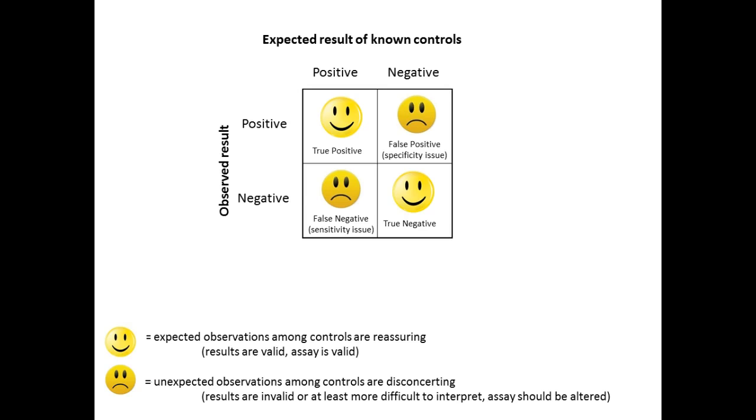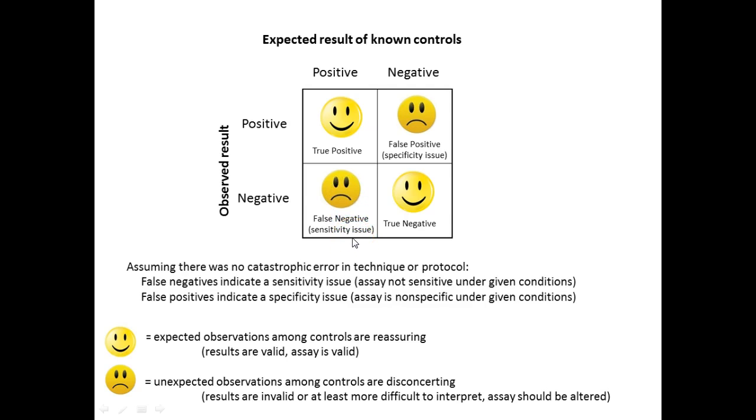So if your observed result is negative, and you thought it was supposed to be positive for your control, this is not good news, right? And this is probably, again, as we said, a sensitivity issue. If you're getting a negative result, it's probably not a negative sample. We just aren't getting within the limitations of that test, right? You probably don't have enough of that substance to tip it over so that this test says you're positive. Make sense? Okay. So, frowny face for that.